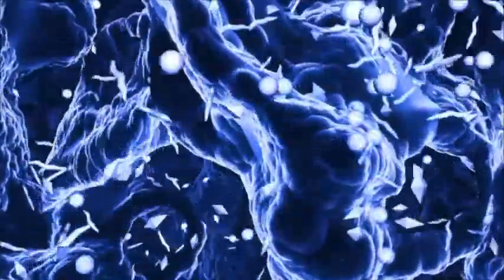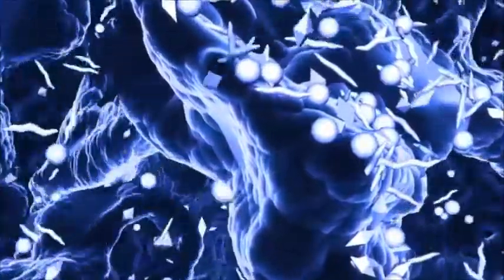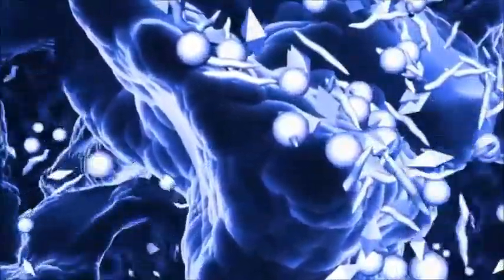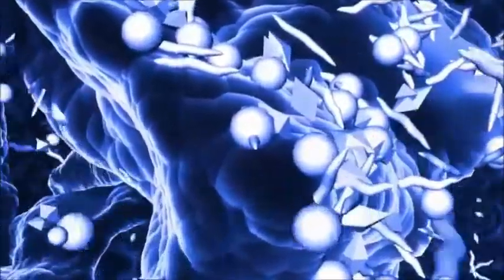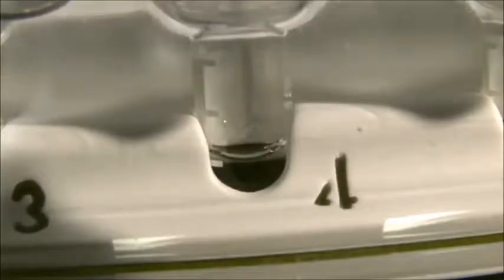What you see here is a representation of our hydrophilic membrane. This membrane is chemically compatible with a broad range of solvents and buffers, has extremely low analyte binding, and is low in extractables. It takes approximately 10 to 15 seconds for the sample to pass completely through the filter, depending on the viscosity of the sample.